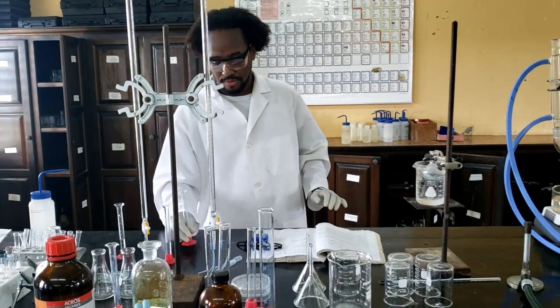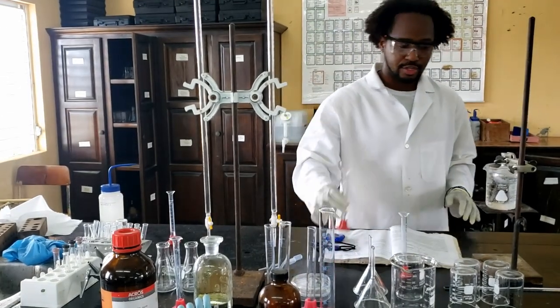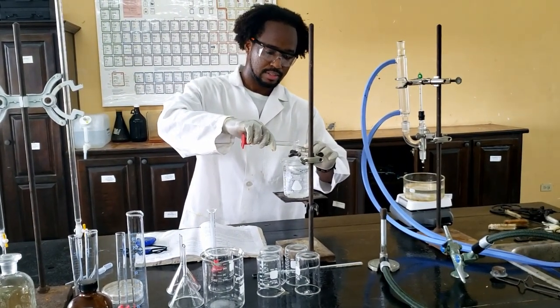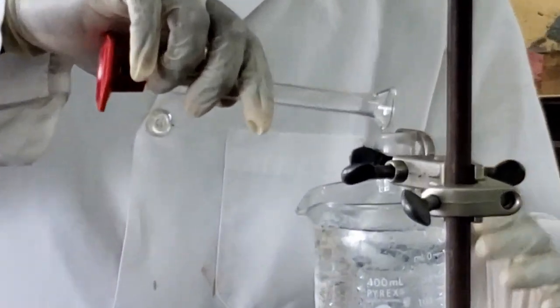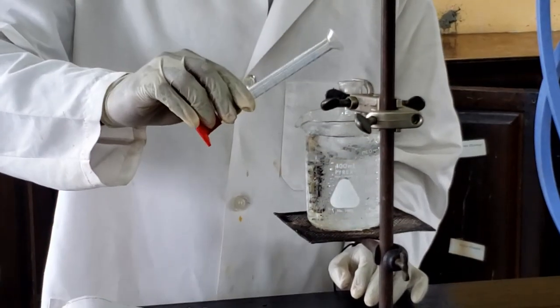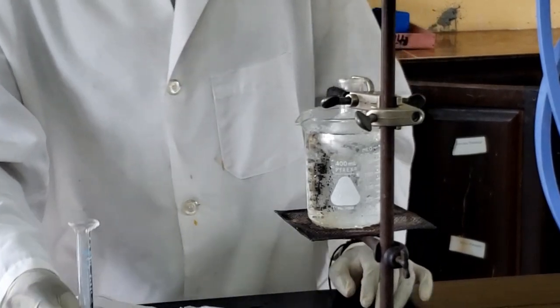I already have my bromobenzene, my concentrated sulfuric acid, and concentrated nitric acid. I'll add the sulfuric acid first to a round bottom flask, set up in some cold water. That's 4 mL of sulfuric acid. And then I'll slowly add 4 mL of nitric acid. This will produce an exothermic reaction, so we want to keep it cool and add it slowly over time.